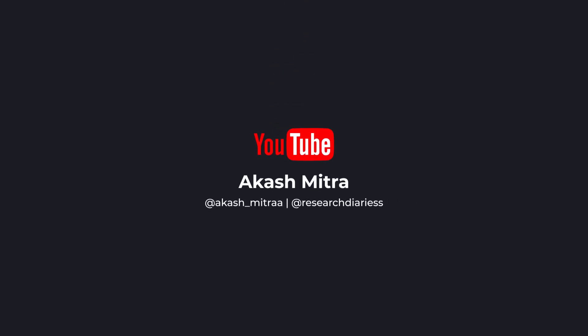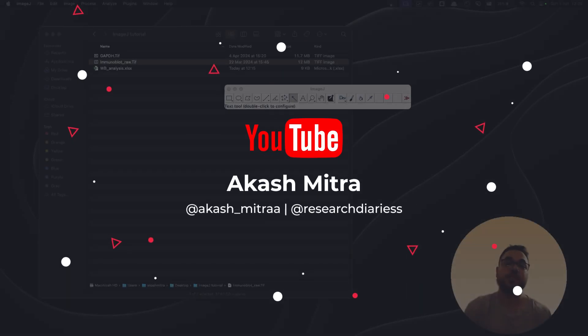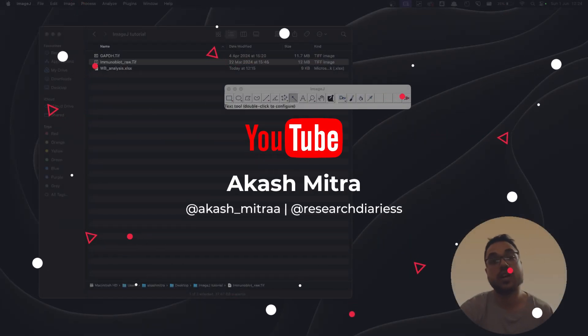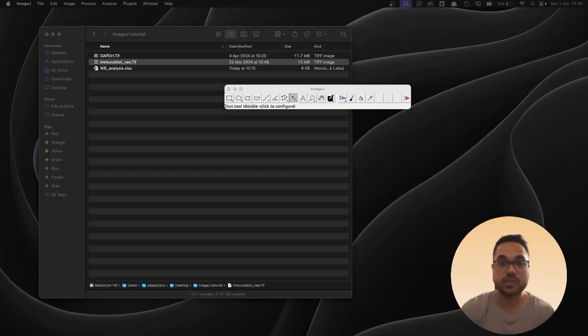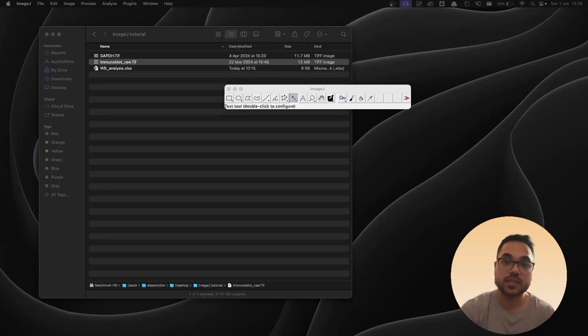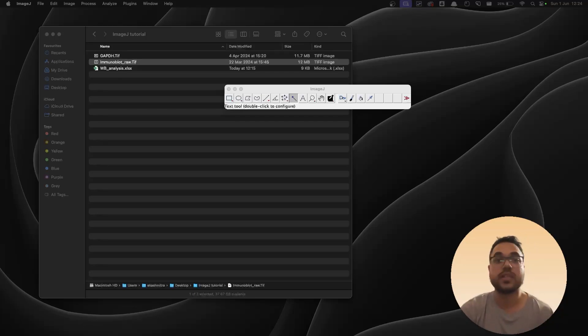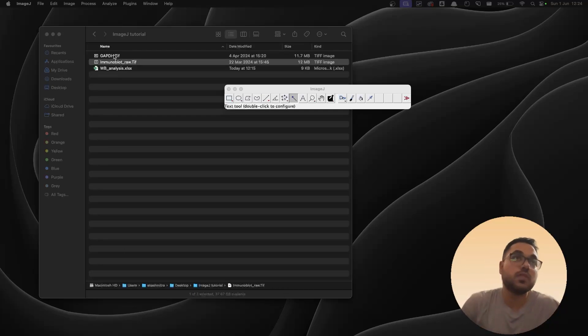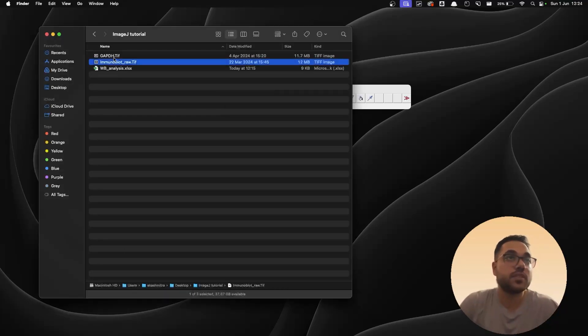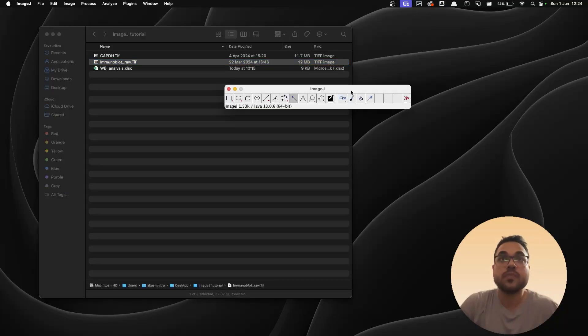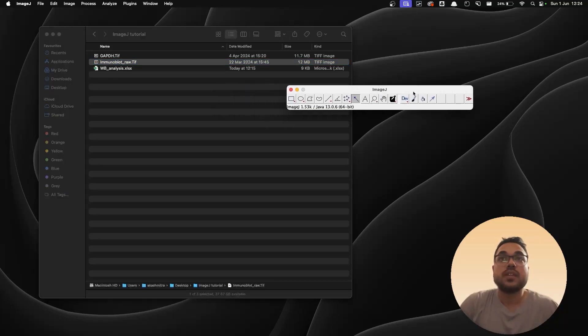All right, hey guys, welcome back to another video. In this one we are going to learn how to analyze Western blot images using the densitometric analysis and we're going to use ImageJ for the analysis. To do that, I have got two blots: one is GAPDH and the other one is another protein that we're going to measure compared to GAPDH because GAPDH is our control.